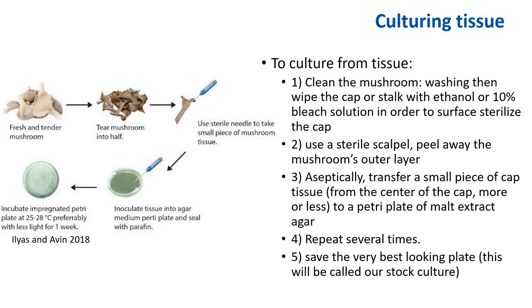To culture from tissue: first, you want to begin by washing the mushroom, then wipe the cap with ethanol or 10% bleach, and don't forget to clean your hands with soap as well. Now you can peel away the mushroom outer layer. Next, you can aseptically transfer a small piece of the cap tissue from the center of the cap to a petri plate of malt extract agar. Repeat several times and after about a week, we notice some small growth from the piece of tissue. Some plates are contaminated with mold; a few appear to be clean and we save those.